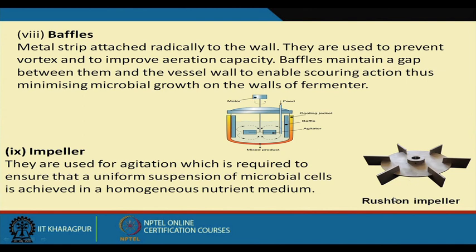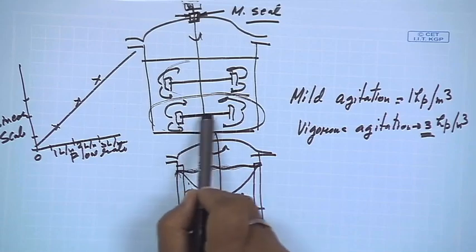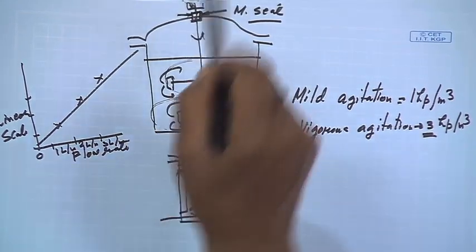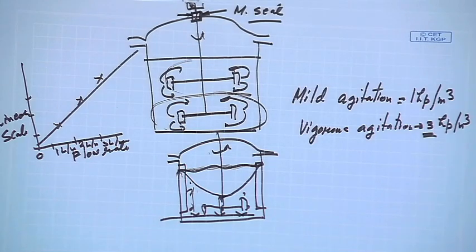Now, when I worked with the industry, I found that we shall have to keep the impeller blades at different levels, because if the height is more, then you have more impellers across the shaft. We shall have to fix so many impellers on the shaft.